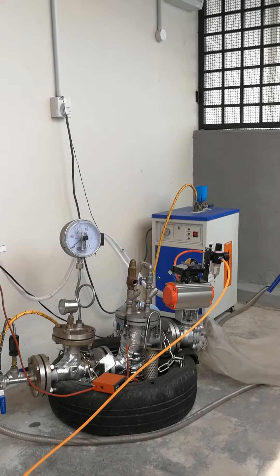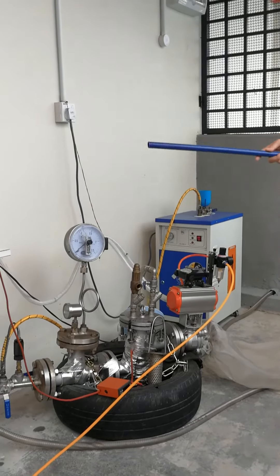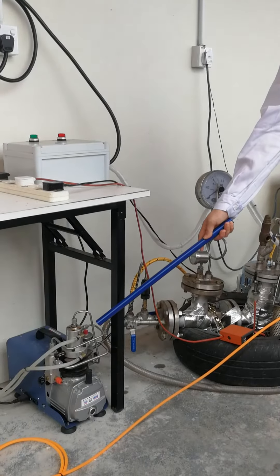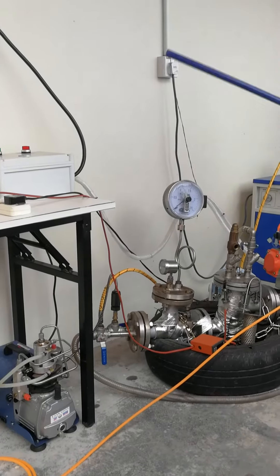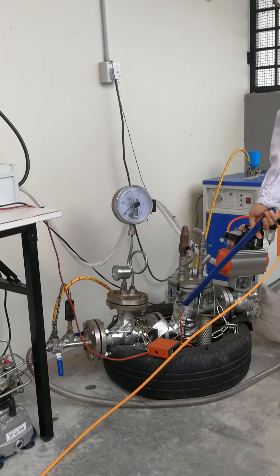The raw material inlet part includes a steam generator to supply steam and an air compressor to supply air. We use the oxygen inside the air to conduct an oxidation reaction with lignin, decouple it, and remove it. The steam and air are mixed inside the mixing chamber and led into the reactor.